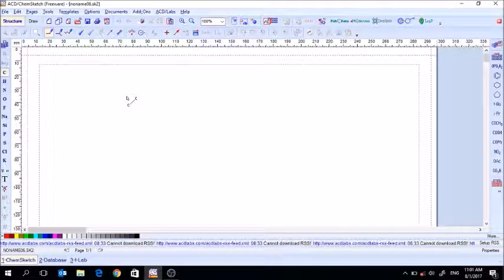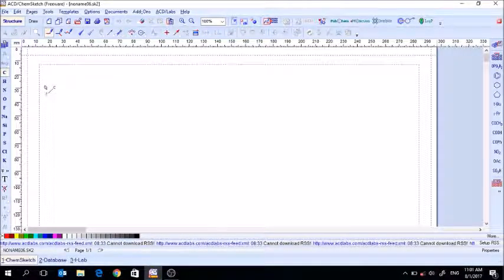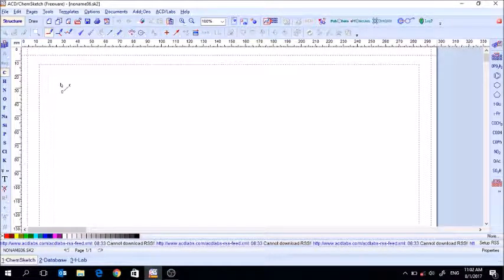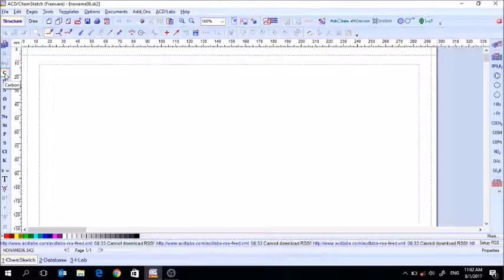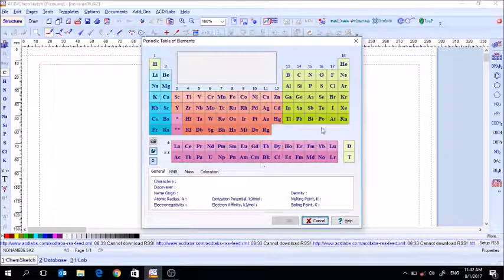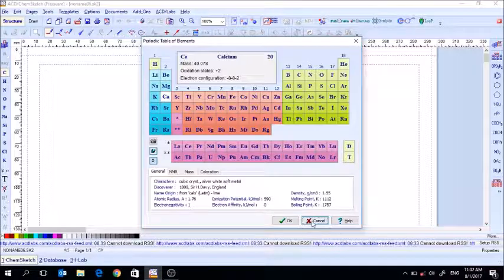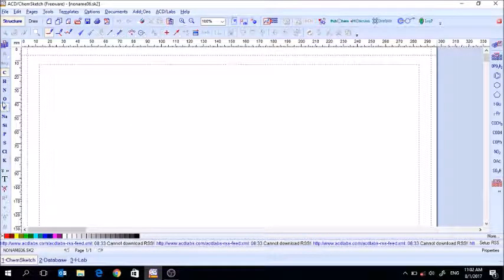Let's go back to structure mode — that's the mode you'll mostly start with because it's where you draw structures. On the left you have carbon, hydrogen, nitrogen, and several commonly used elements. If you need an element that's not in this list, go to the top and click the periodic table to pick pretty much any element you want. We'll start with the ones in the quick access toolbox.